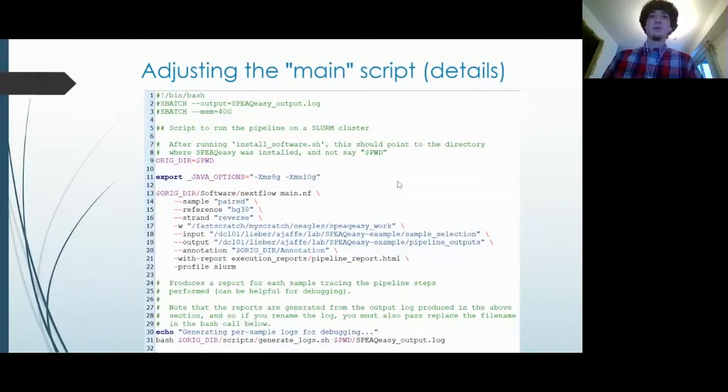The reason I recommend this when you're sharing the pipeline is because if you share a working directory with other people, the working directories get very large, and in practice, you probably will want to be able to delete them to free up space for large experiments. And if you do that while someone else is running their pipeline, it interferes with their execution. So I always recommend keeping that to a directory that you personally own.